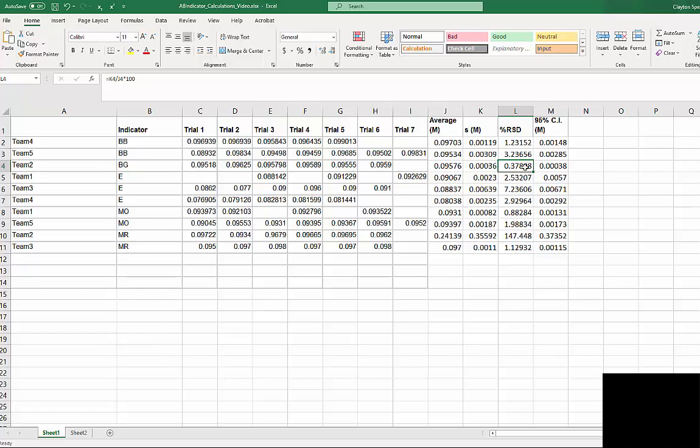So not bad. All right, so we've got another big number here, another 147%. Let's take a look there. Aha! Here's a cell value that's, again, 0.9. So I'm guessing it's just a typo. We're going to insert that 0. All right, good.